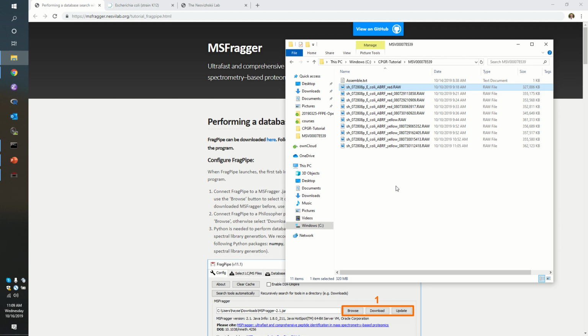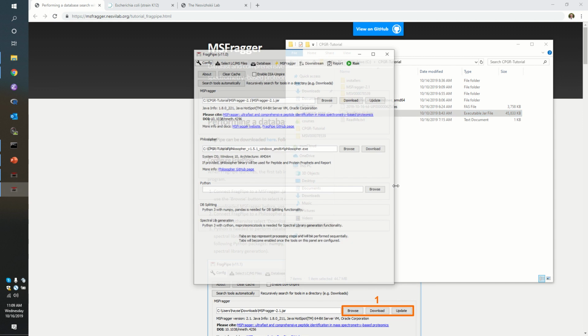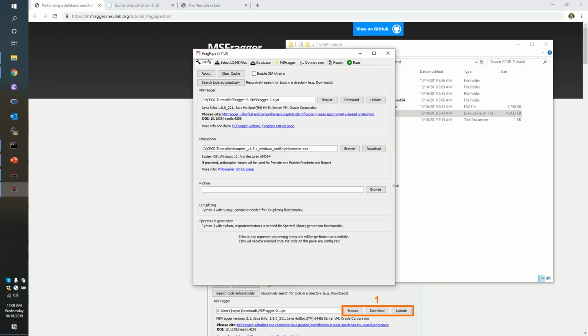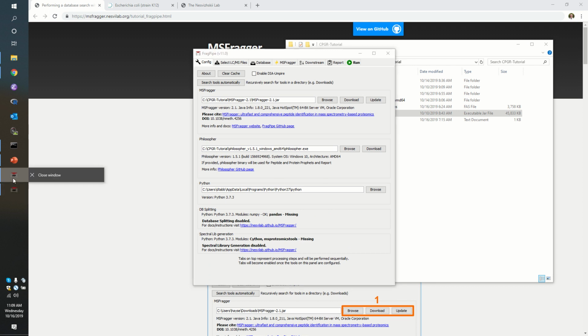All right, now to go ahead and get us kicked off, I think it would be really valuable if we start the FragPipe software. So FragPipe 11.0 jar is the software I want to run. Because I have Java installed on this machine, I can just double-click it or hit enter on it, and it will open. That's really handy. Oh, I actually have 2 copies of it open now. Ha. So I'm going to close my other copy in the background here.